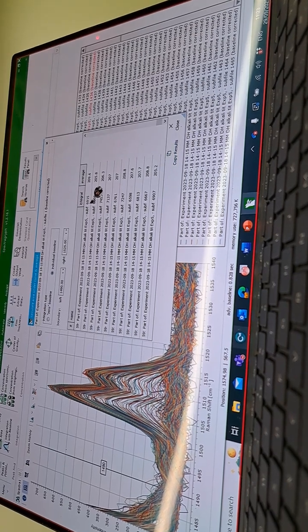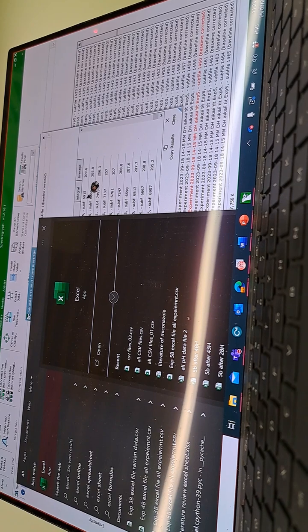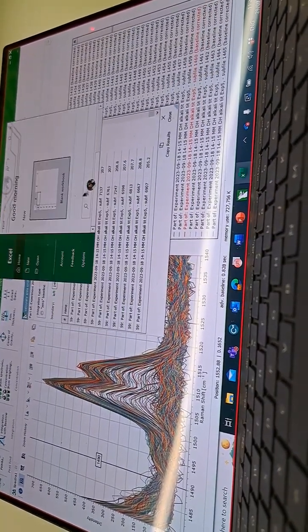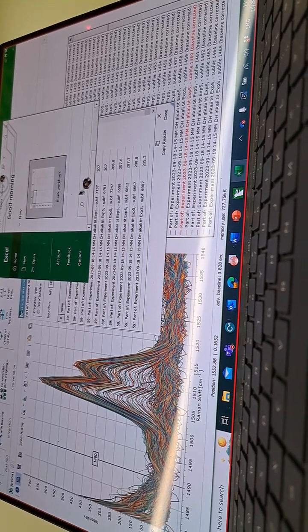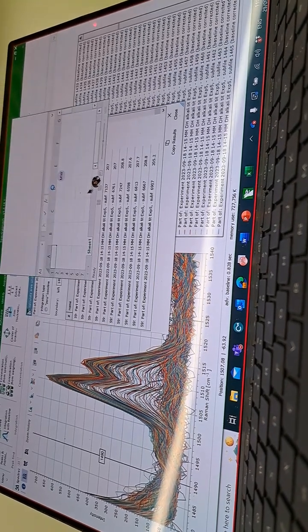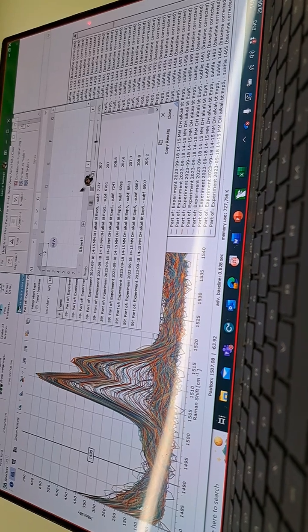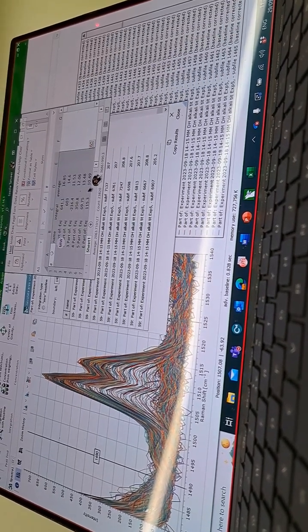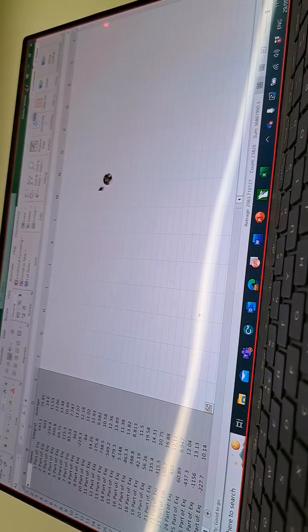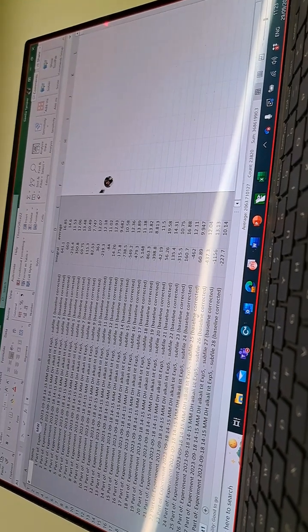When I asked how they monitor it, he said they also just leave the slurry stirring for days. Here we are forcing the system to disproportionate, but there they saw with a few of the salts that they just disproportionate by themselves, slurrying and stirring, and at some point they just change to the free base.